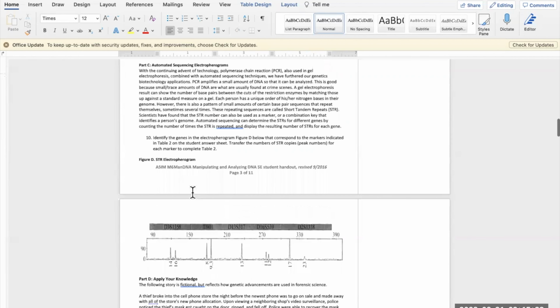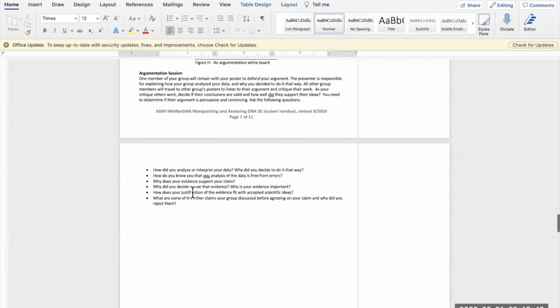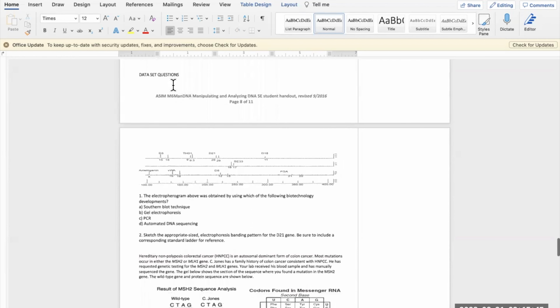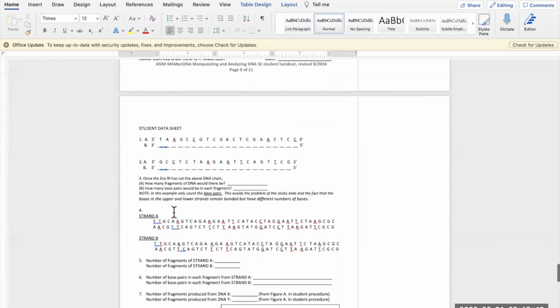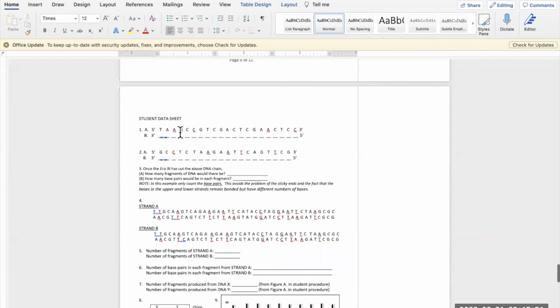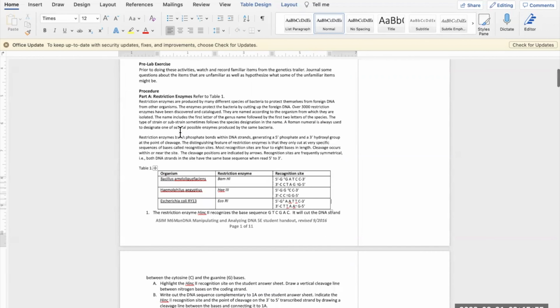So let's go to your student data sheet. Okay, GTC-GAC, we're going to highlight that.